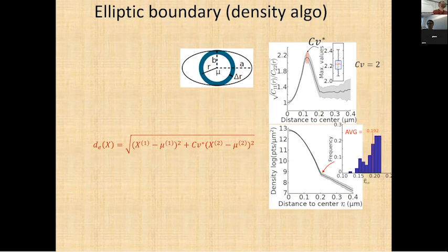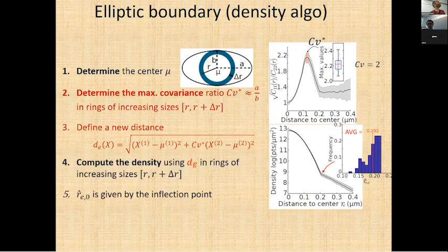I don't want to discuss the case where you have an ellipse. It's a little more subtle because you have to do a renormalization, since what you have in one direction is not what you have in the second one. So it becomes more subtle to extract the two coefficients, because at some point the next circle that you're going to use is not going to work. You have to renormalize, but this you know because you can calculate the ratio, as I explained. But let's not enter into this point.